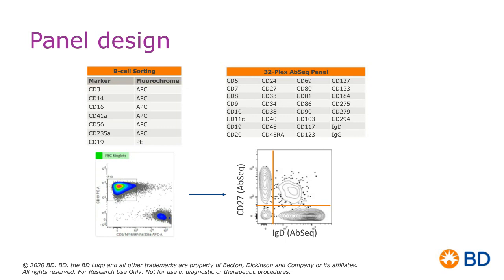It's a rather rare cell population that you're trying to look at. Now, if you wanted to look at 20,000 of those cells, you would have to do single cell analysis on hundreds of thousands of cells, basically, to try to find the TFH cells that are of interest. So we've chosen to just isolate and enrich for the CD19 positive cells.